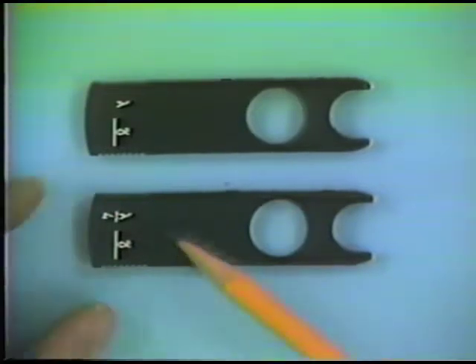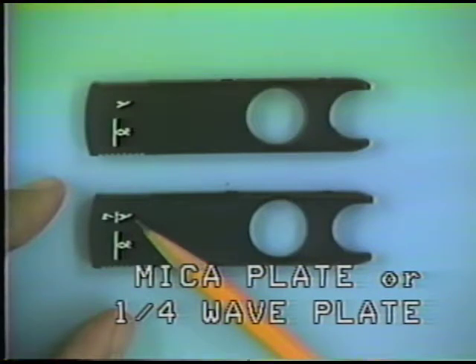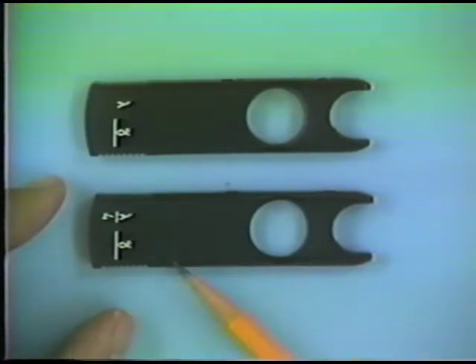This other kind of accessory plate here is called a mica plate, or quarter wave plate sometimes. There's a symbol lambda over 4 on this plate. Sometimes you will see the word glimmer on this, which is a designation for mica plate if it's of German manufacture. So lambda over 4, quarter wave plate, mica plate is another very common kind of accessory plate. Well, what do we do with these plates?